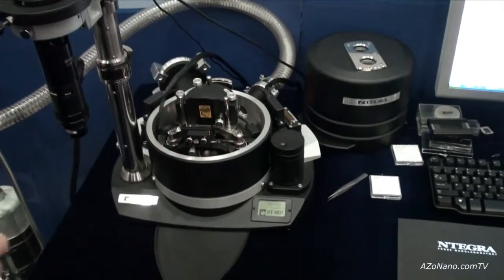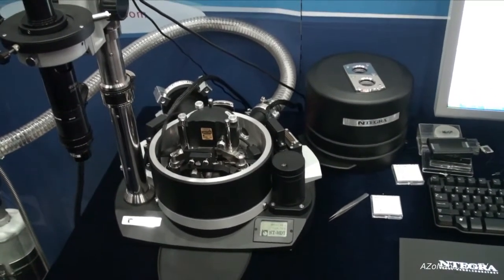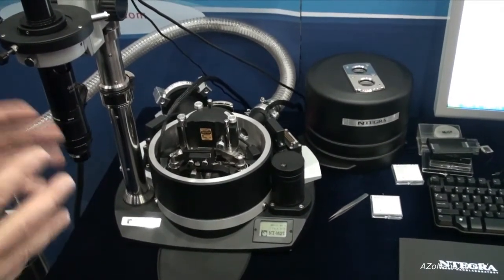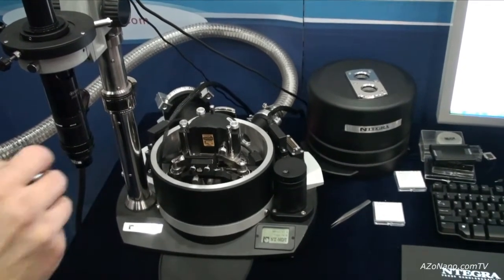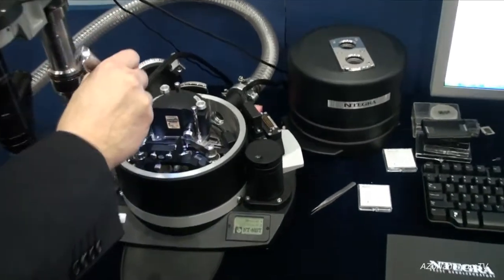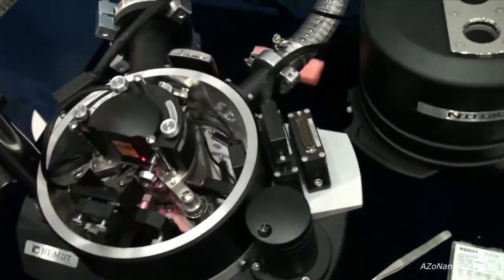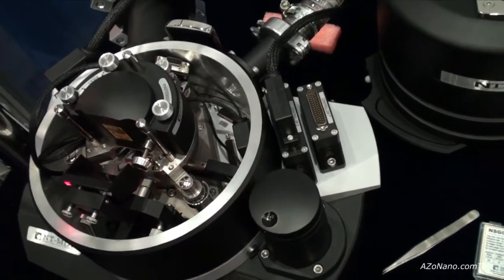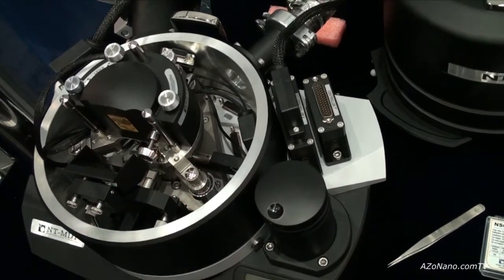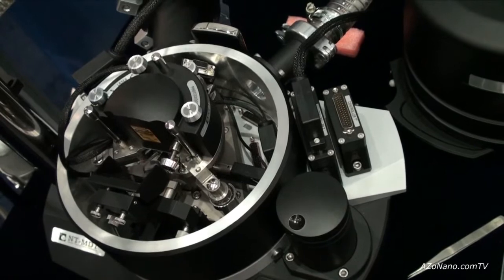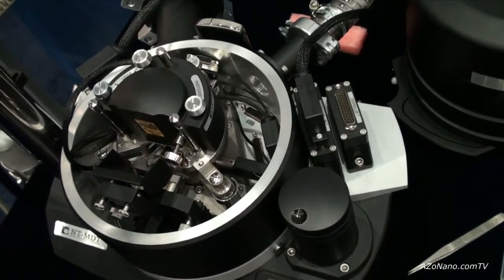The concept of Integra allows it to be very focused on applications, built due to the reason we put inside the system a very little part which is changeable. You see this triangle which is now closed and which keeps the scanner in this construction can be changed to another one. I'll show you examples.